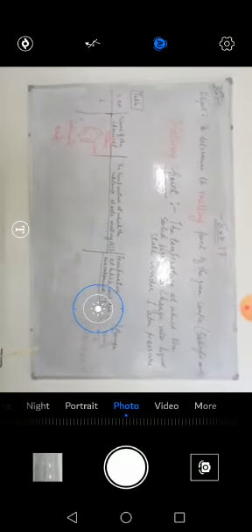Melting point is the temperature where we determine when it starts to melt and liquify. That is our temperature record, the melting point.